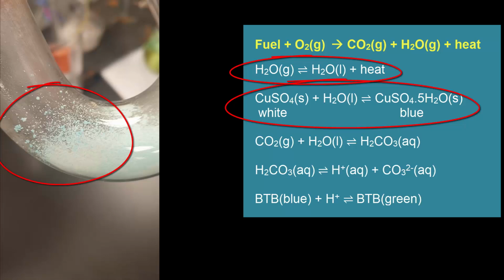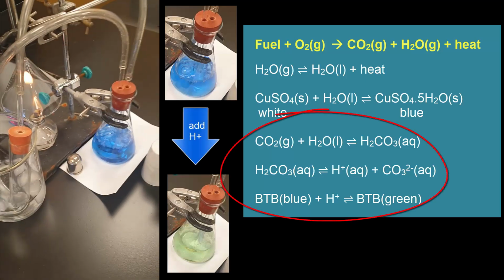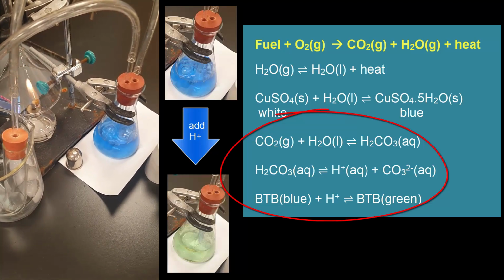So it was easier to see the water condensing. Not in the right place, but that's fine because the system took a lot of tweaking. It wasn't running perfectly. Okay, the main reaction is this one here with the whole thing, showing you the whole reaction all at once.